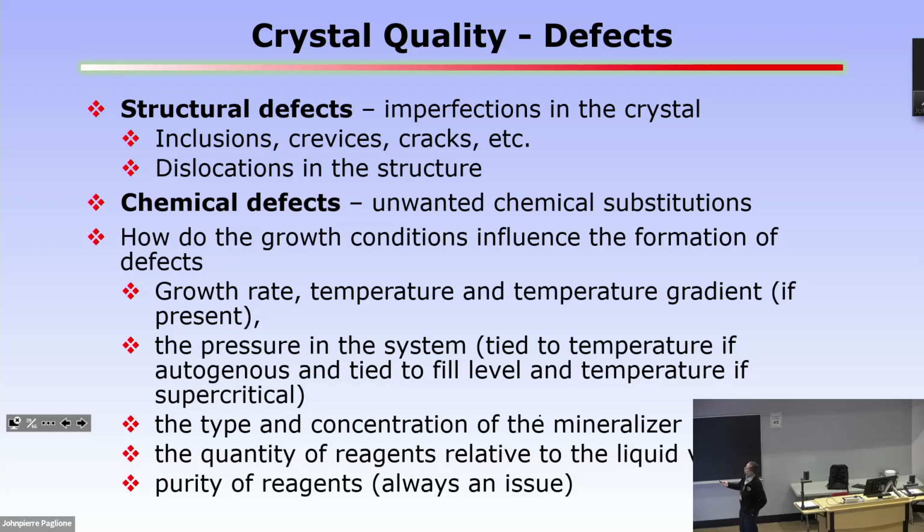If you have inclusions, that really sucks, because there's not much you can do. That has to do with what crystallizes first and what crystallizes second. So then you need to play with the concentrations. And so you have a lot of variables that you can play with. So it's a very multidimensional phase space. And it depends on how patient you are and how willing you are to go down different axes on the phase diagram.